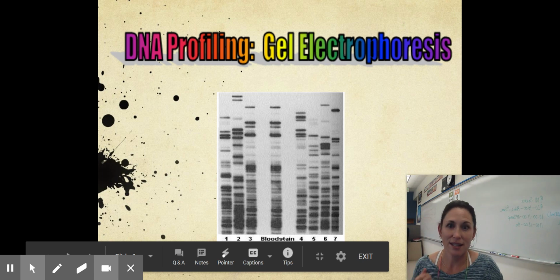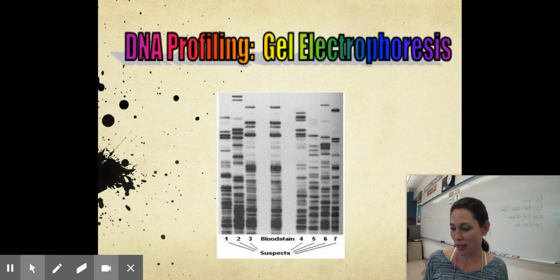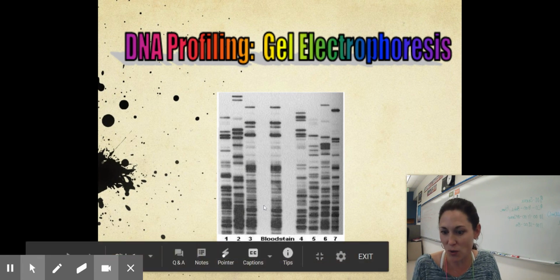Hey everybody, this is Ms. McFadden, and I'm here to talk to you about DNA profiling and gel electrophoresis so you understand what it's used for and how we'll use it in the next couple of days in our classroom.